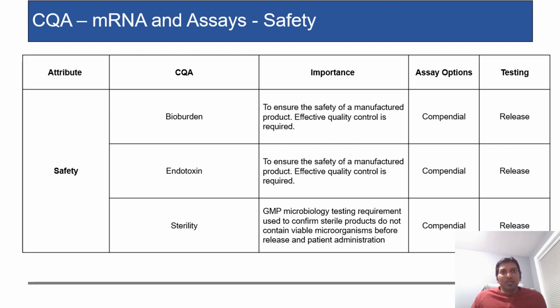Looking at safety is more like regular bioburden, endotoxin and sterility. Regular compendial methods are used, and these are well defined for a lot of products. There's nothing special about these things. We just follow the regular norms.